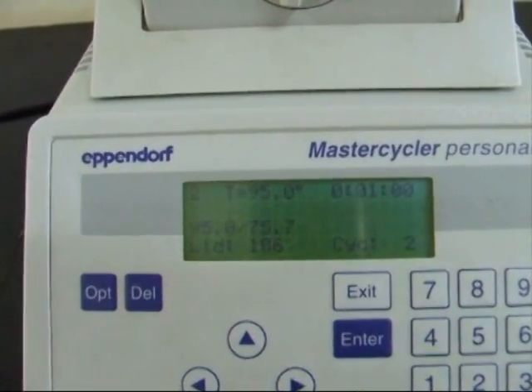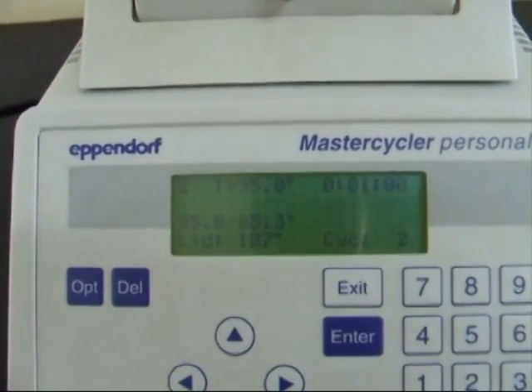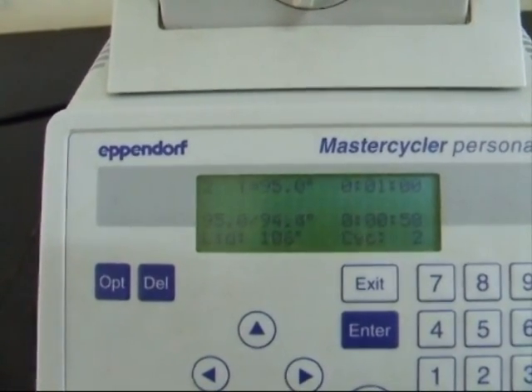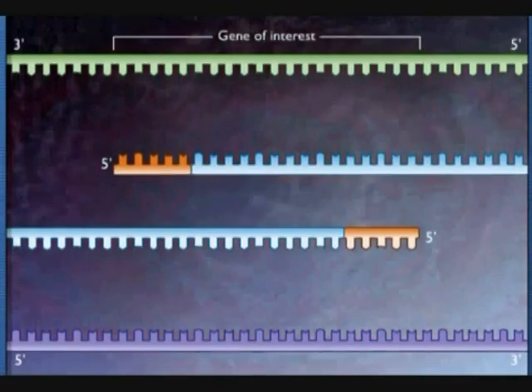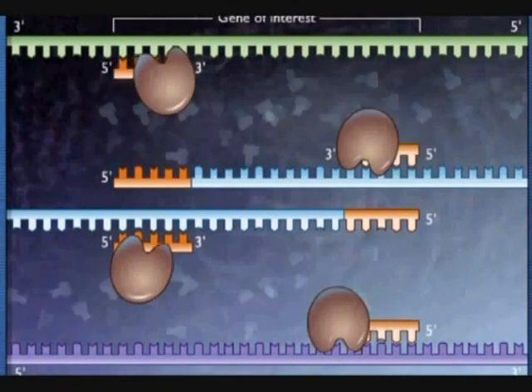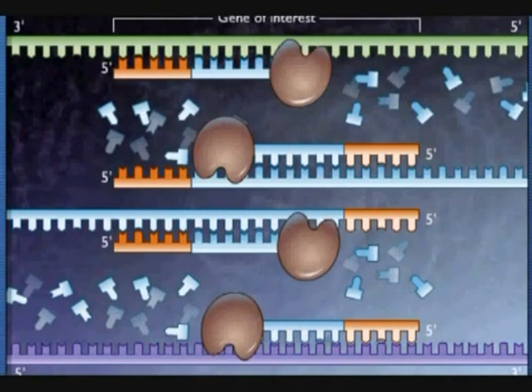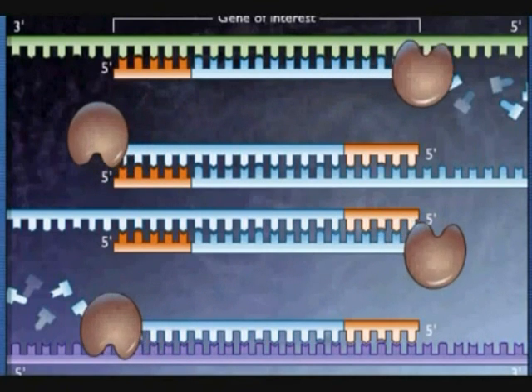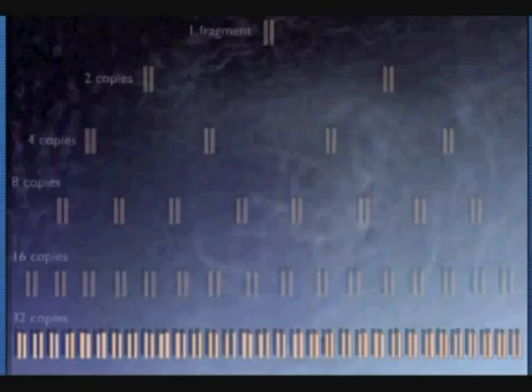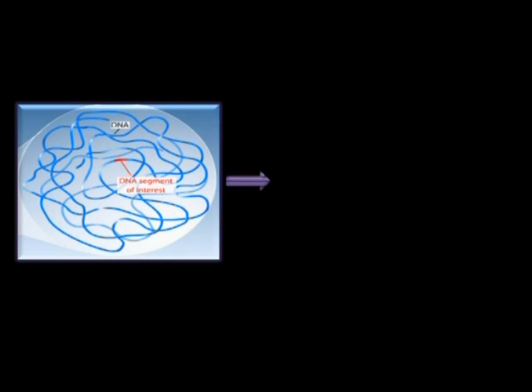Now, as you can see, when the cycle is over, it gets to the second cycle. The steps from step 2 to step 4 repeat for 30 cycles. Thus you can see an exponential rise in the number of fragments. After PCR, analyze the sample using agarose gel electrophoresis.